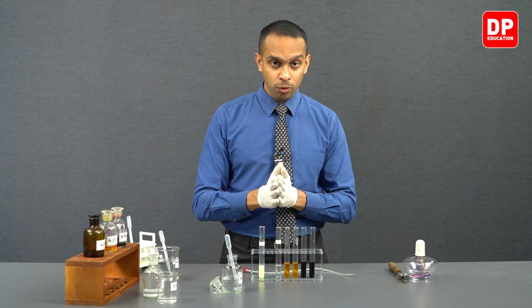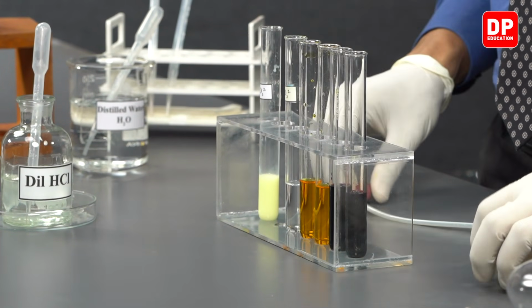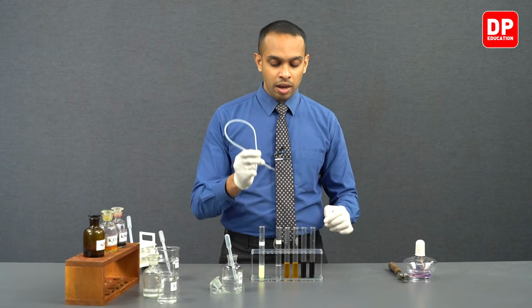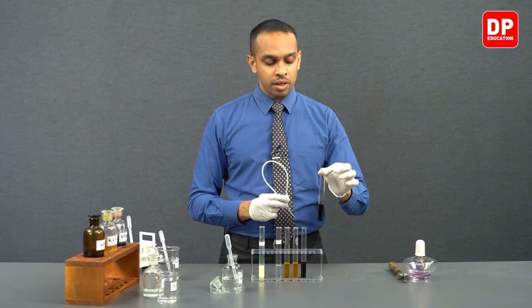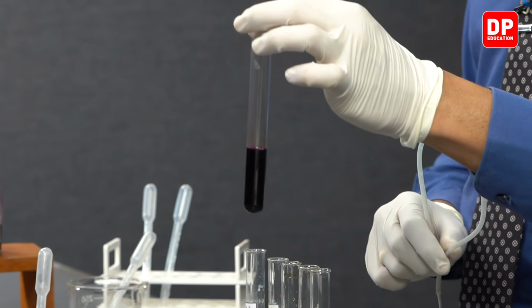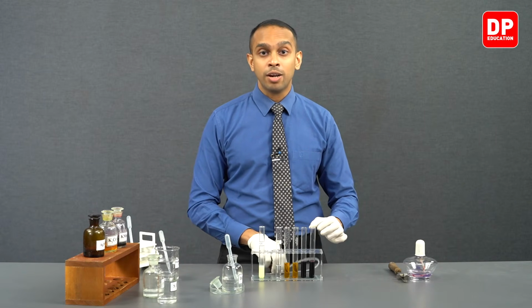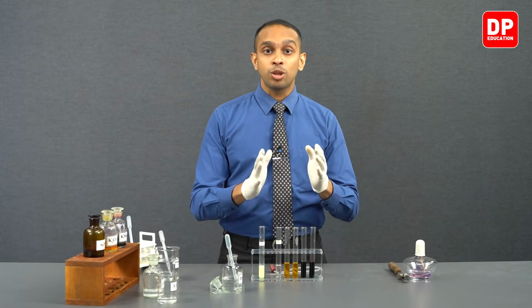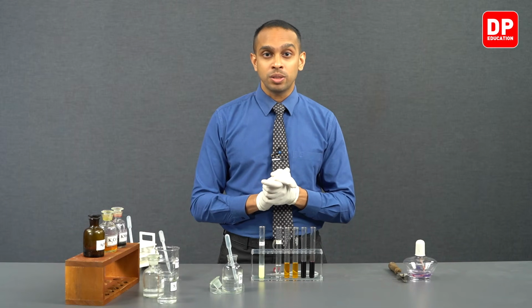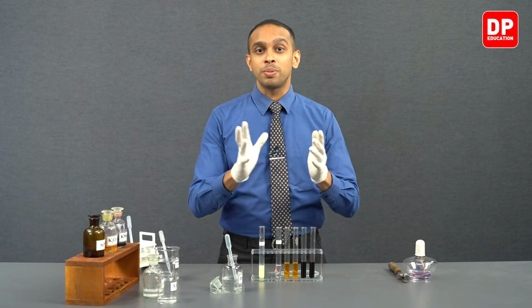and then before we add HCl to this, we will be taking a delivery tube and we will insert the other end of the delivery tube inside an acidified potassium permanganate solution. Now we initially observed when sulfur dioxide gas is bubbled through an acidified potassium permanganate solution, the color of the potassium permanganate solution disappears.